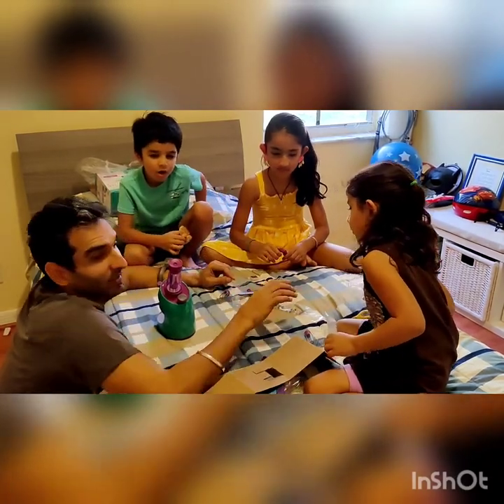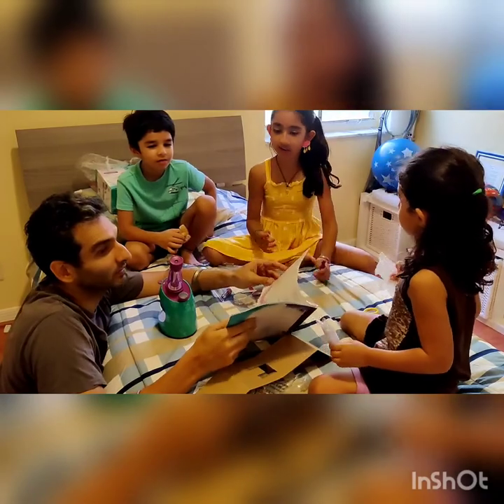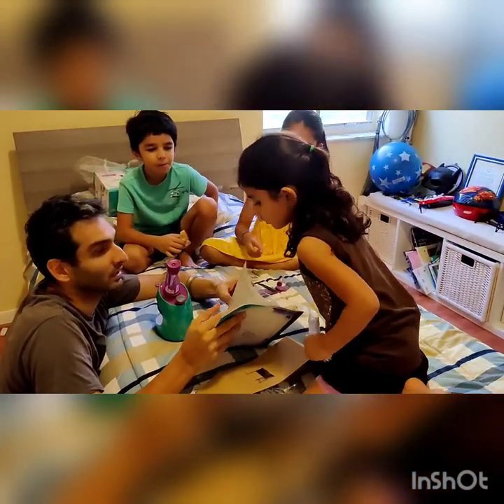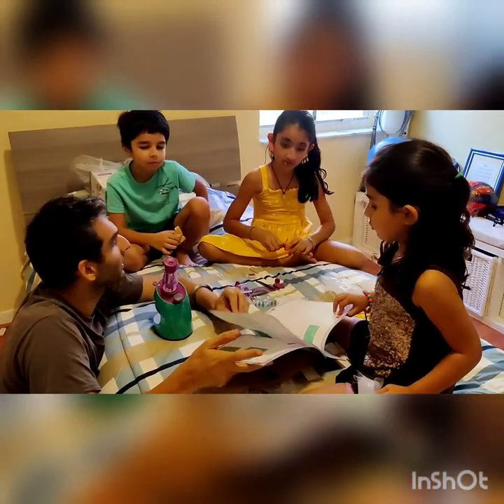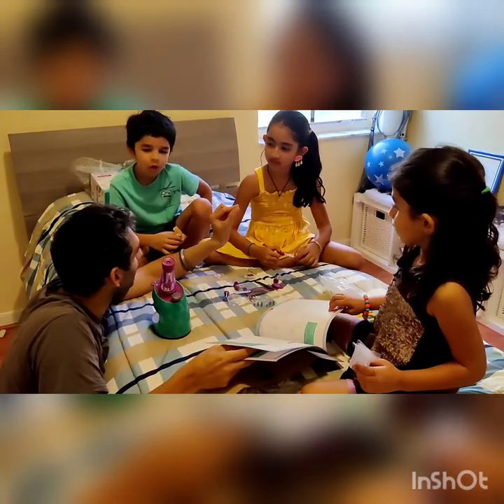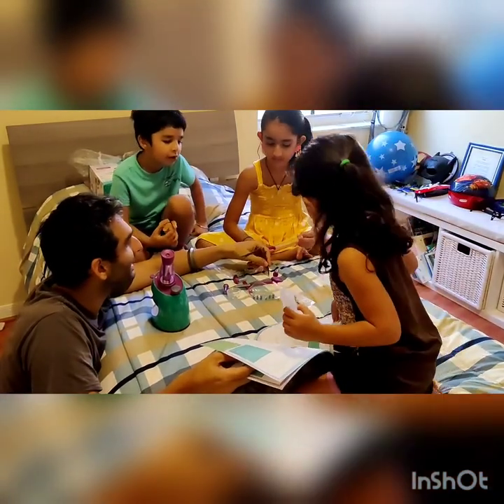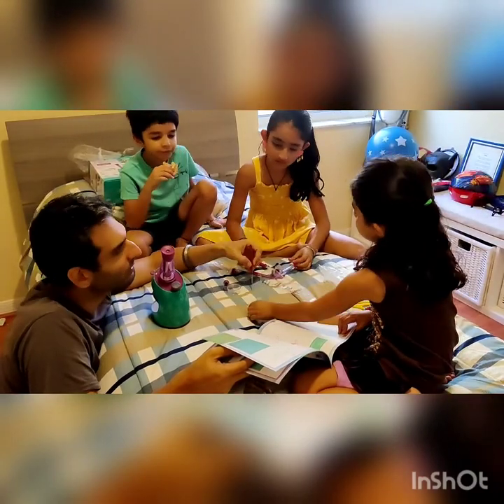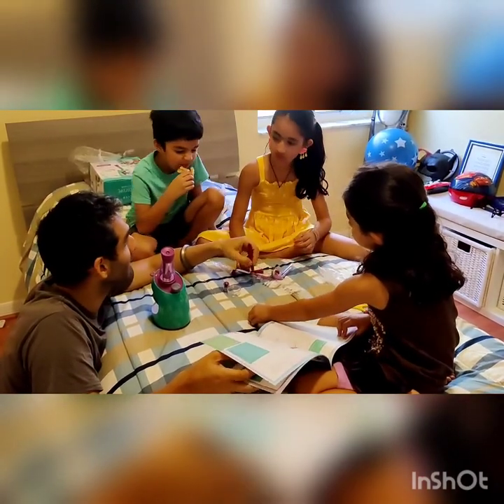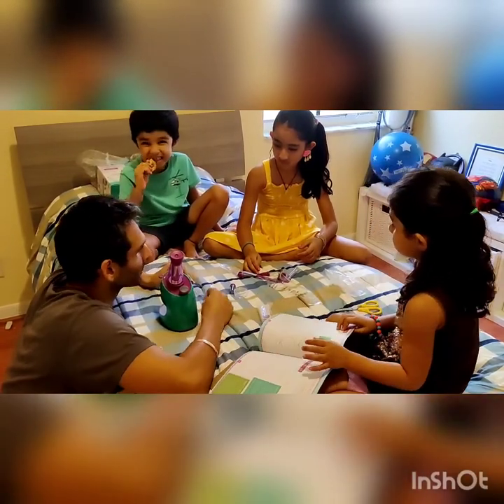Now, some of the experiments in this: you take an onion and cut it up. Then you put a small piece of that onion, very thin, and you use these needles, something pointy, to tease it apart. You move it like that because it'll be so thin.